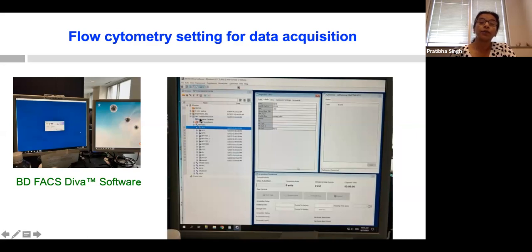Here I put the particular experiment that we were doing that day, NPY overexpression. Then we put what kind of samples we were doing. Here we were doing bone marrow cells, looking for hematopoietic stem and progenitor cells. So I just put bone marrow HSPCs, followed by tubes.